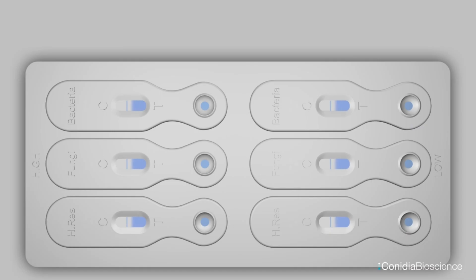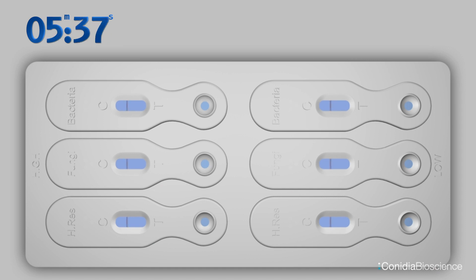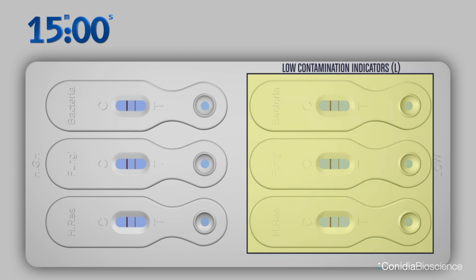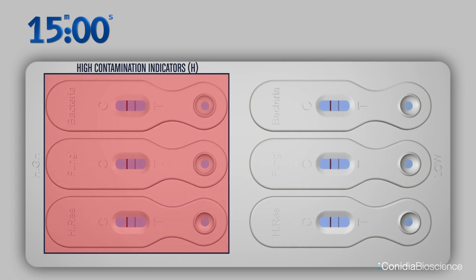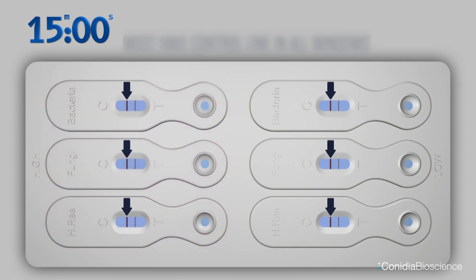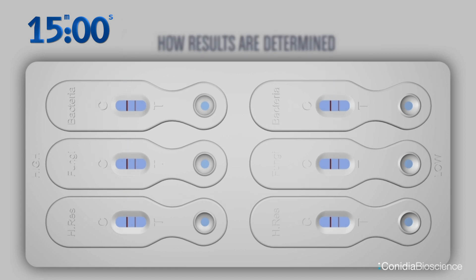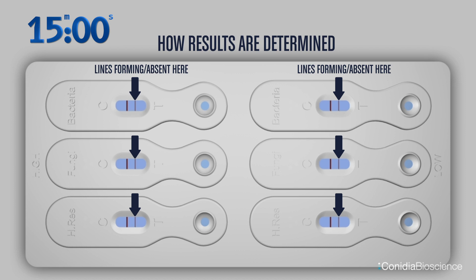Wait 10 to 15 minutes. It is best not to touch the test during this time. This is the control line, C. This is the test line, T. This side is the low contamination indicators, L. This side is the high contamination indicators, H. Successful tests must have a control line in all windows. Read results within 15 to 30 minutes after placing sample fluid into the sample wells. Results are determined by either lines forming or being absent on the low side, or on both low and high.